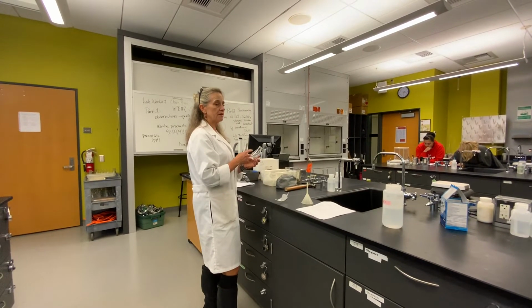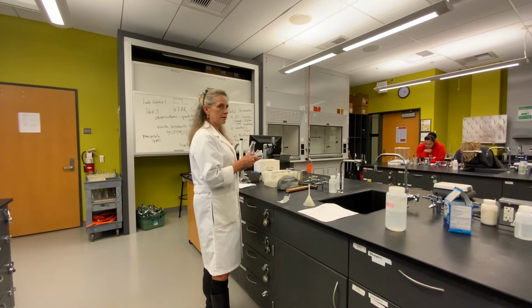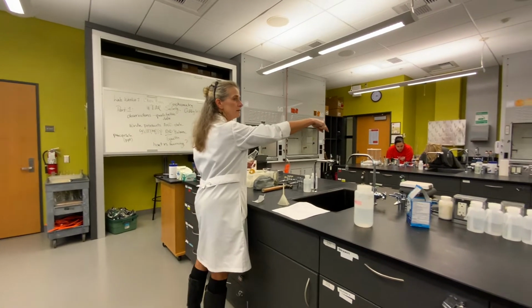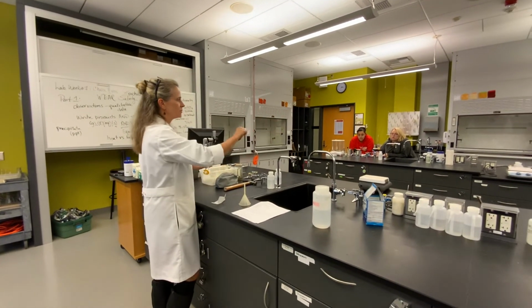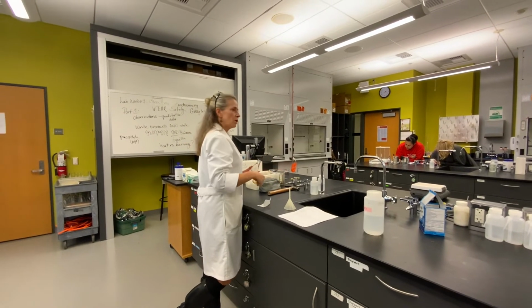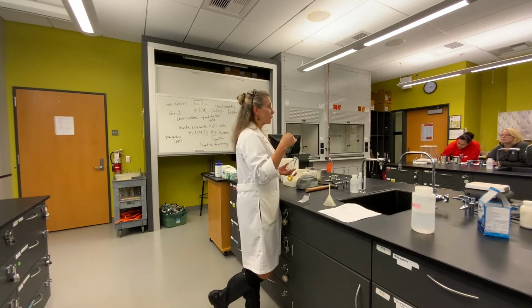It's the evolution of a gas. You're going to see it, okay? What you want to do is drive it all away, all right? So you're going to stir, and you're going to put it on the hot plate, okay? And the hot plate goes between 80 and 90 degrees, I think. The reason for that is we don't want to heat the water enough to boil it away. We just want to drive off the carbon dioxide.